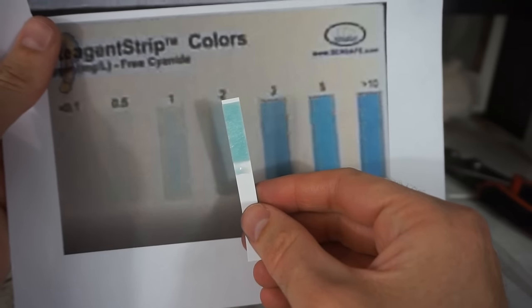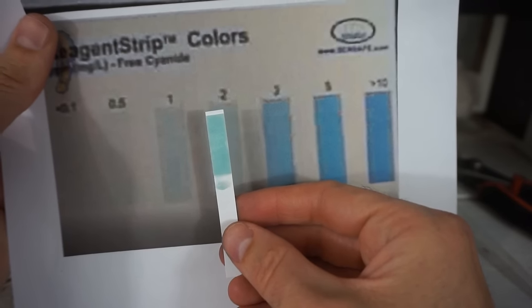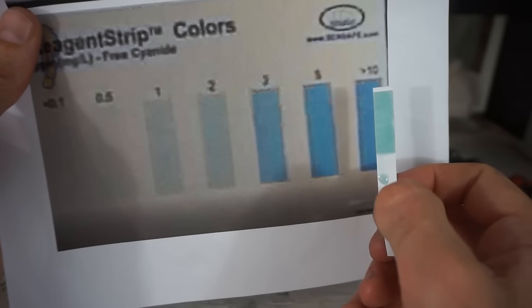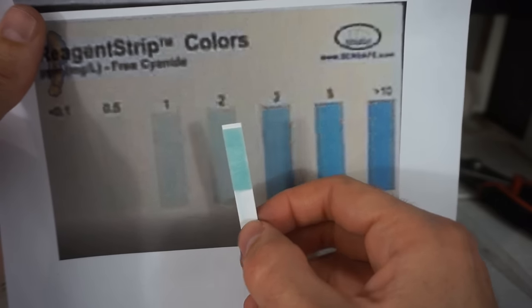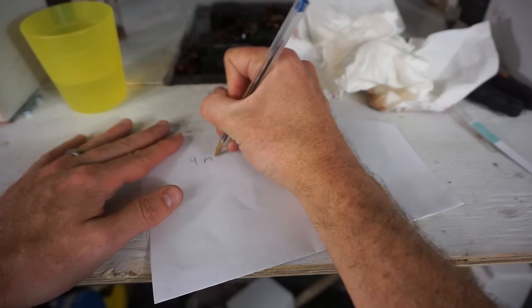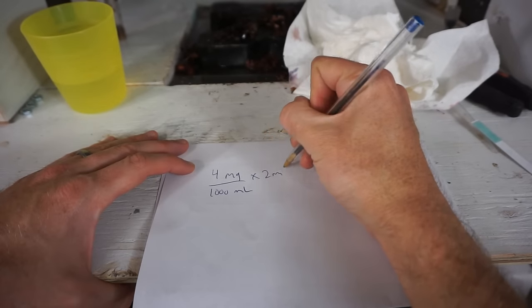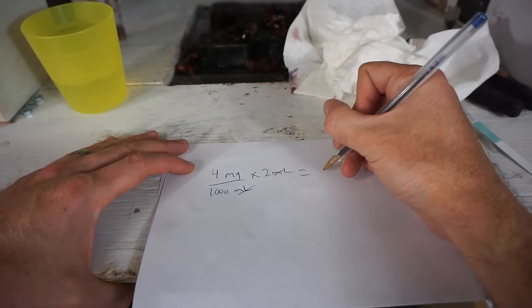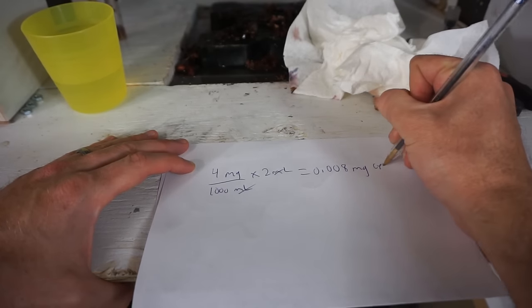This is kind of hard to tell but I would say this is around 2 to 3 parts per million, anywhere in there. Definitely not greater than 10. So I'm going to say 2 parts per million but we diluted it by half. So I had 4 parts per million, so that's about 4 milligrams per 1000 milliliters. And then I had 2 milliliters of that concentration. So that gives me around 0.008 milligrams of cyanide.